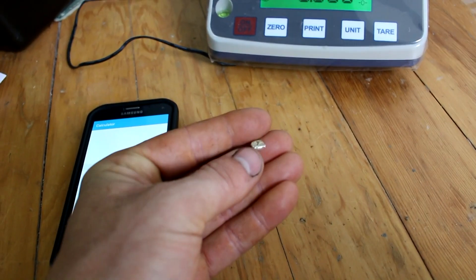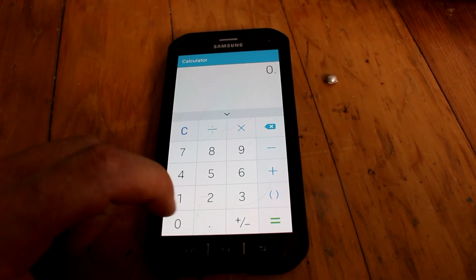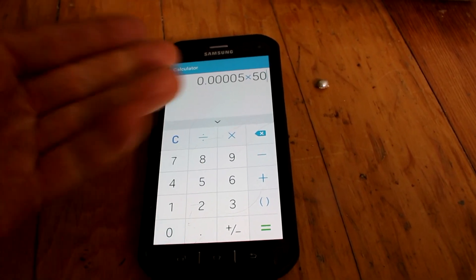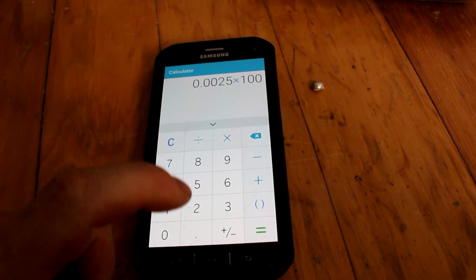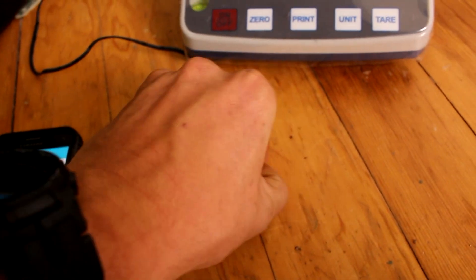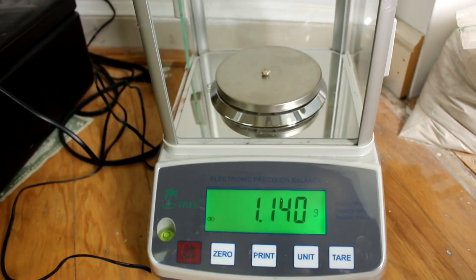Here's the silver bead after I've cleaned it up a little bit, and there's the precision scale. But before I weigh it, let's actually double check how much silver I should have expected. Let's assume I could extract 0.00005 grams of silver from each popper, multiply that by 50 — because there's that many per bag — times 100, the number of bags I bought. That means I should expect a quarter of a gram of silver. I can already tell this is probably more than a quarter gram. Getting 1.14 grams — that's actually more silver than I was expecting.